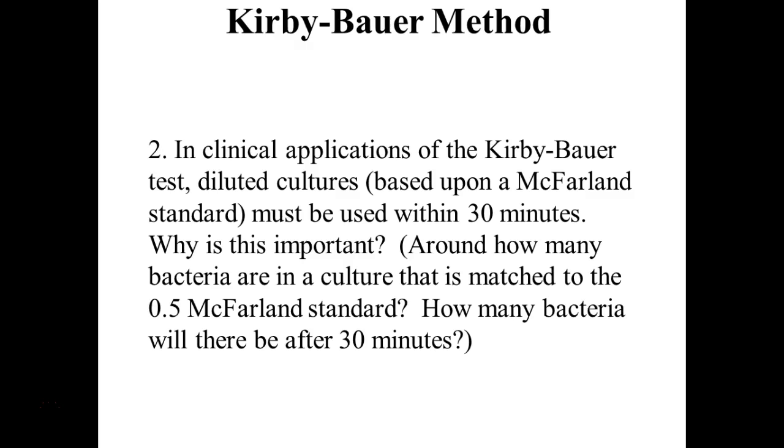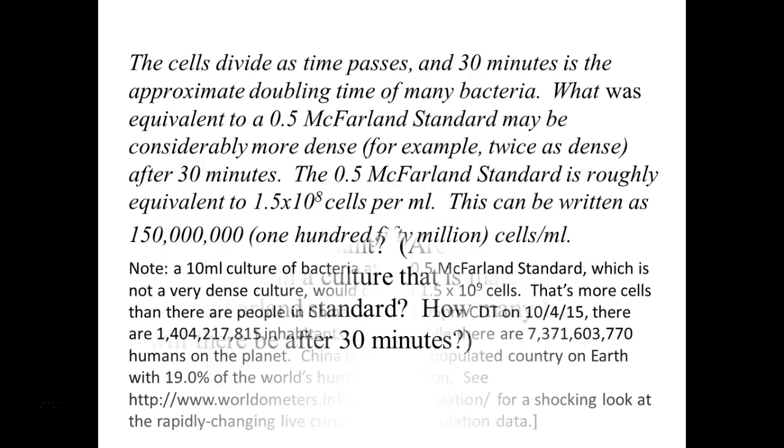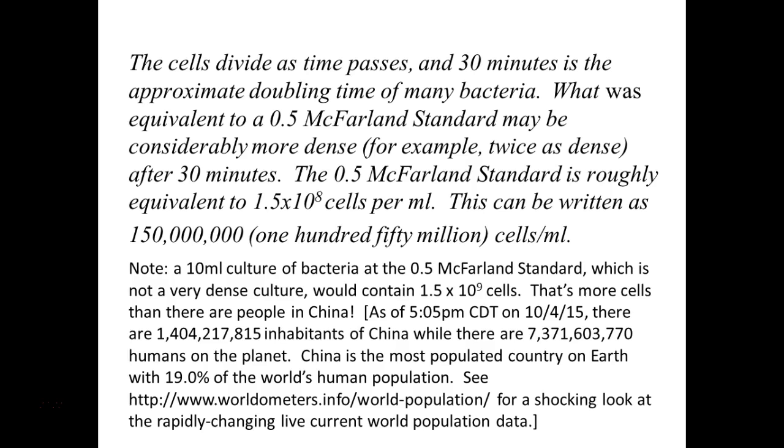We want enough bacteria that when we swab, and if you swab properly, we get a complete lawn of growth. But if you have too much bacteria, would this affect our result? Yeah, the more bacteria, the more antibiotic you would need to kill them. So this test is standardized so that we have an approximation of a certain number of cells that we're plating per milliliter, a particular concentration. And as I said, in an actual lab, they have specially designed spectrophotometers. Instead of just eyeballing the turbidity as we did, they'll actually use a machine to make sure that it's at the right concentration.